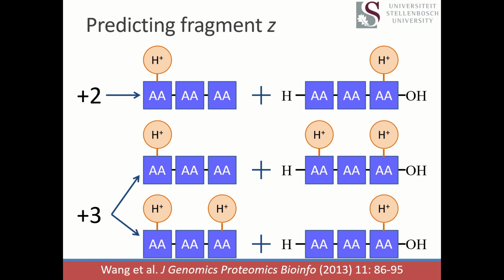I already mentioned that you get the most common types of breakages of peptides when the prior carbonyl attacks across the one in front of it. There is no carbonyl to attack after the first amino acid. So you have 10 amino acids, 9 peptide bonds. The normal reactions imply only 8 of those would actually be broken.